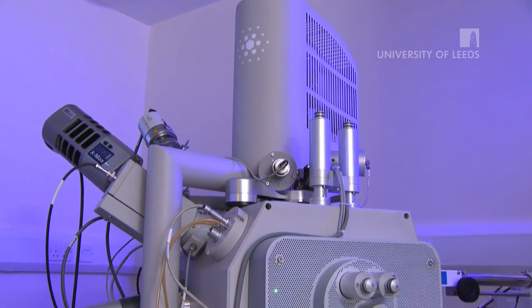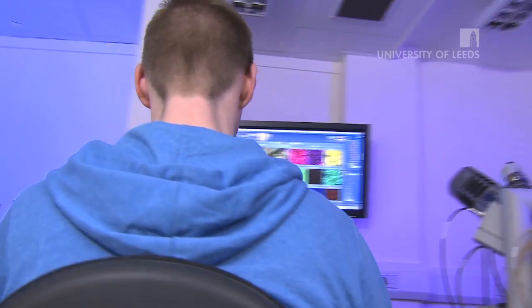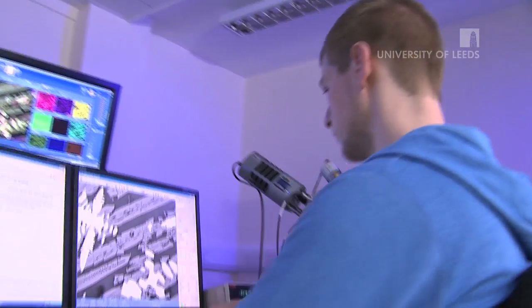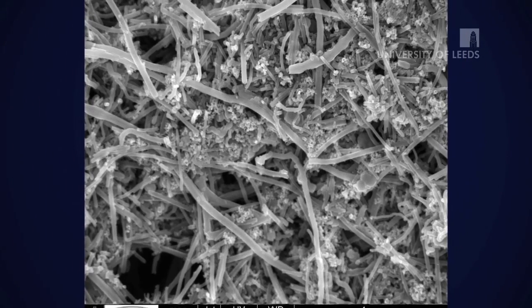The scanning electron microscopes that are principally used for imaging and analysing chemically the surface of bulk solids. And the reason we want to do that is that the surface is the component that interacts with the outside world in a particular application, such as an engineering application. And we can achieve resolutions of the order of micrometers and perhaps below on this analysis.